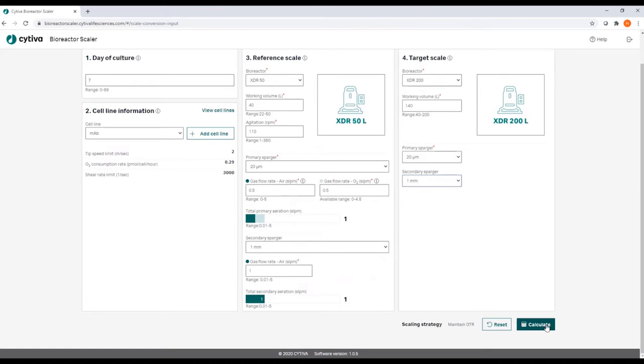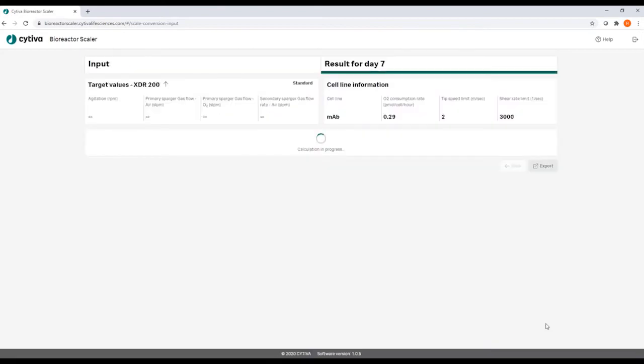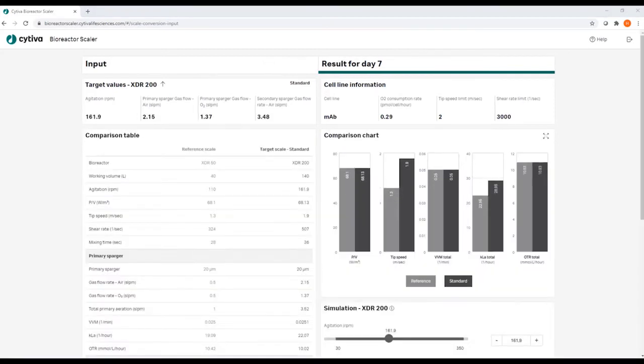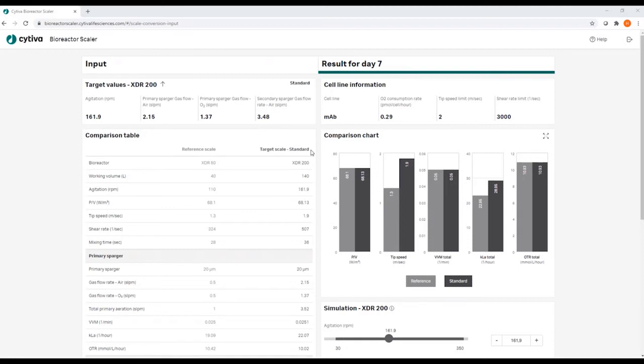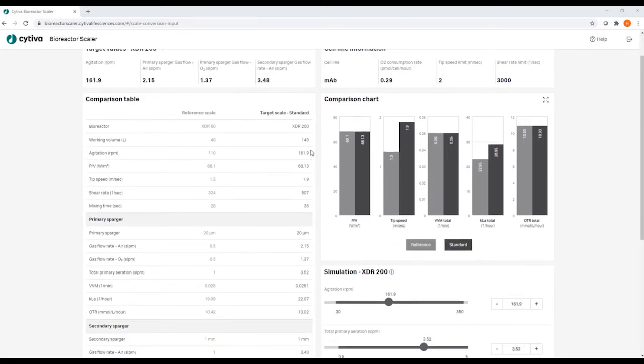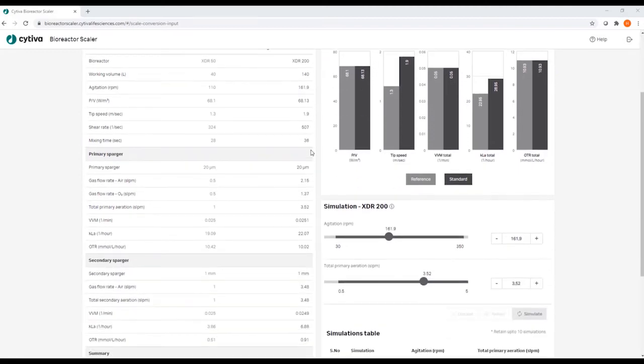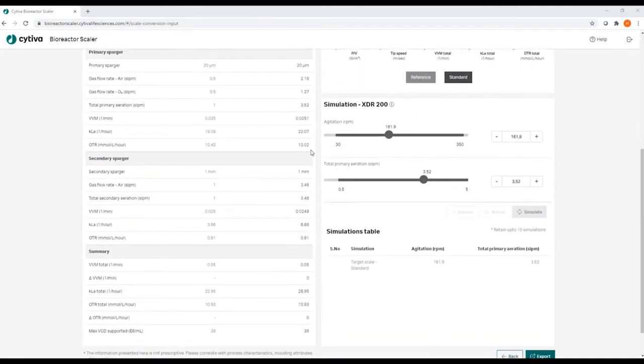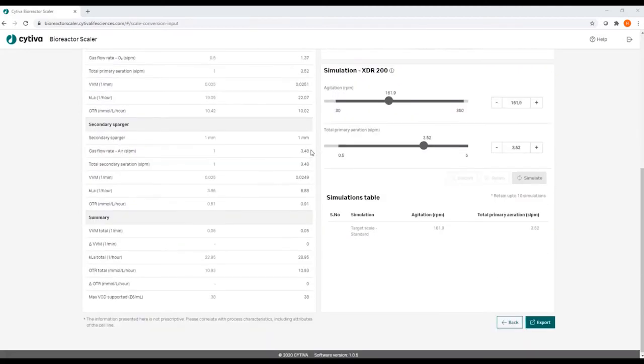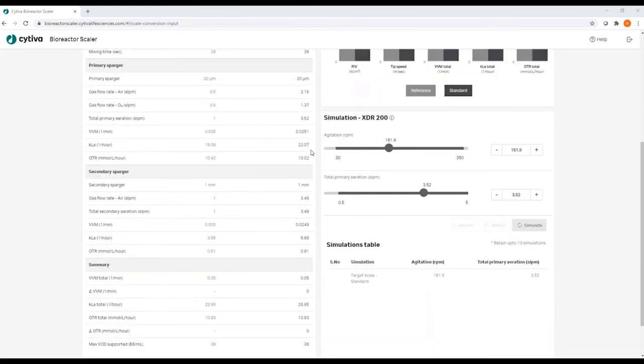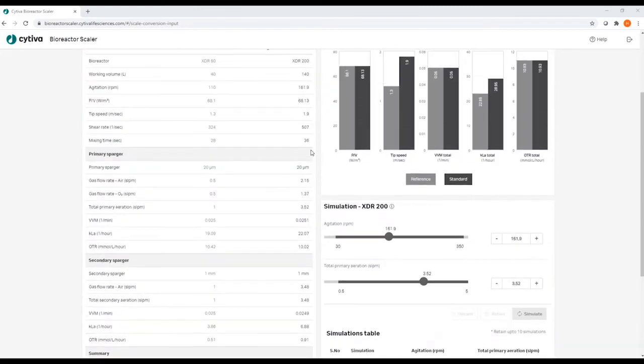Then it's time to press the calculate button and you come to the result tab, which at the top shows some target values for the target scale. You see a comparison chart for some key parameters for the target and reference scale, as well as a comparison table with a number of computed parameters.